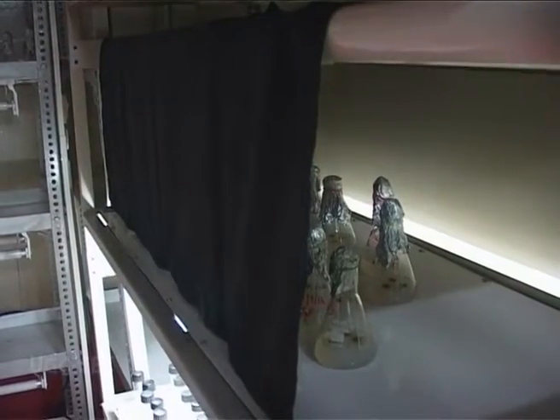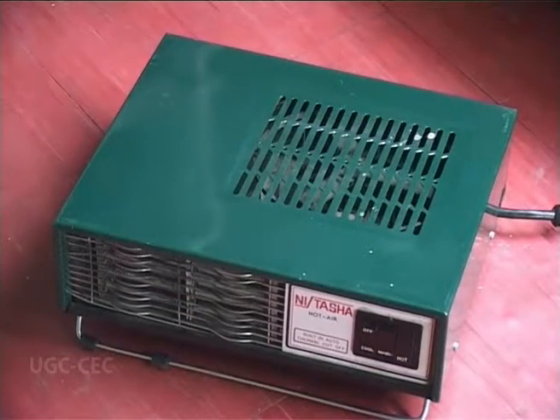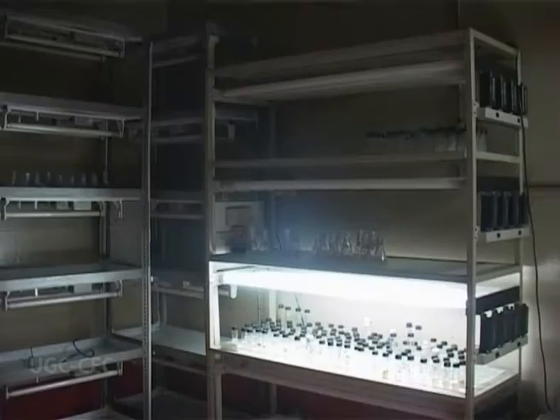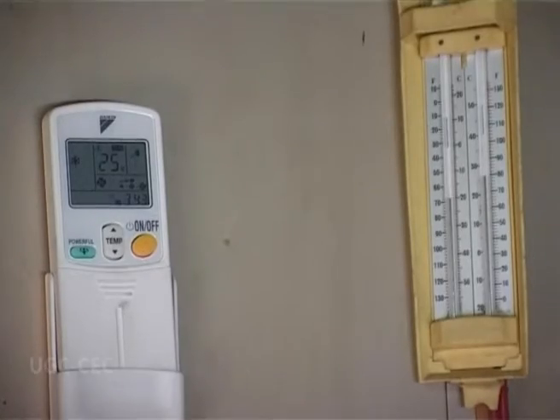When light is not required, the racks containing culture vessels are covered with black cloth. High temperature can be maintained by traditional heating systems. Cooling is accomplished through air conditioners. The relative humidity of the culture room is maintained at 50 to 60%.